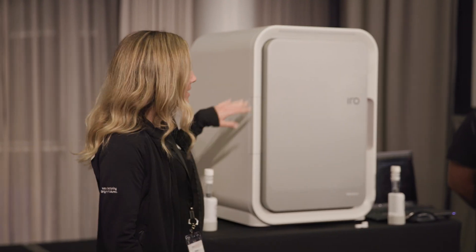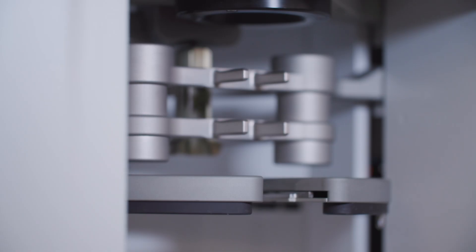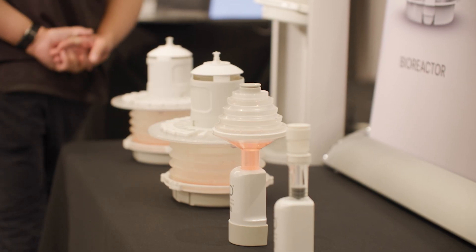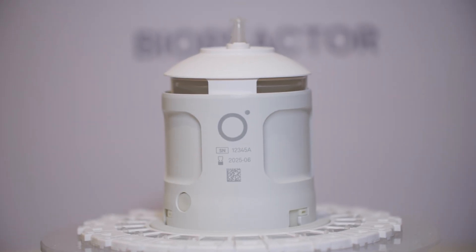So this is called the Eero. It does act as an incubator, so the internal environment here is held at 5% CO2 and 37 degrees Celsius. The value of the platform is being able to massively reduce manual intervention, more consistently hit dose, and ultimately speed product development timelines.